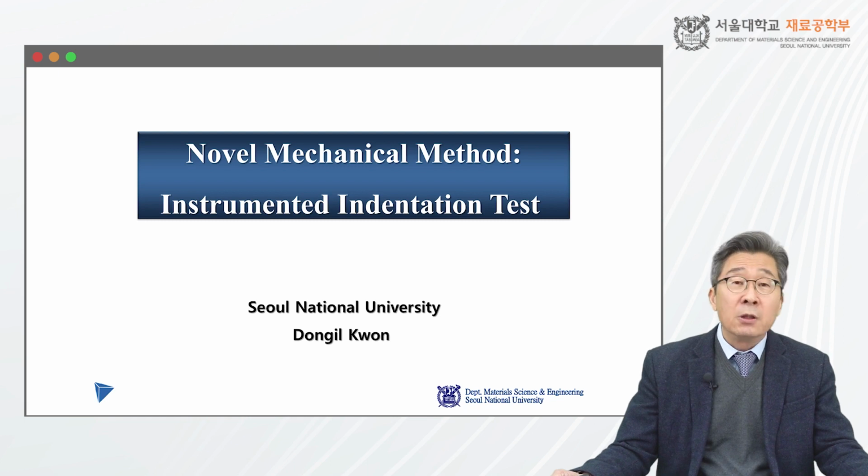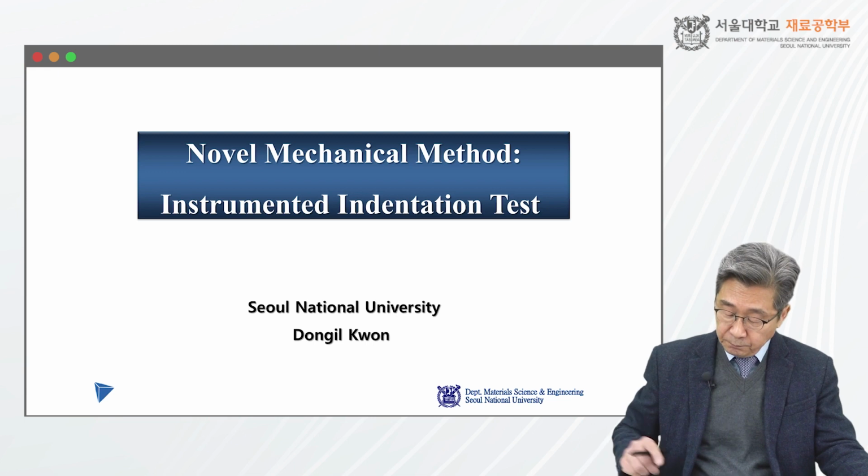So the important features and advantages associated with instrumented indentation testing will be first described, and then some of the application examples will be shown. Finally, I would like to wrap up my talk by showing standardization activities associated with IIT work.